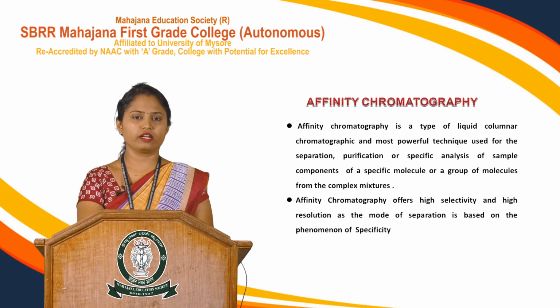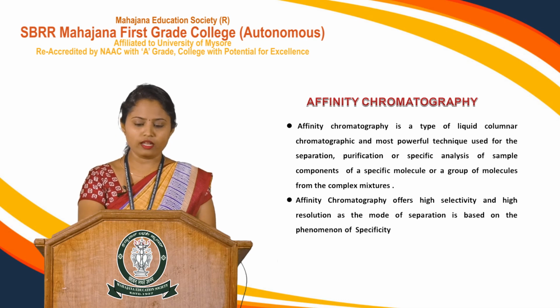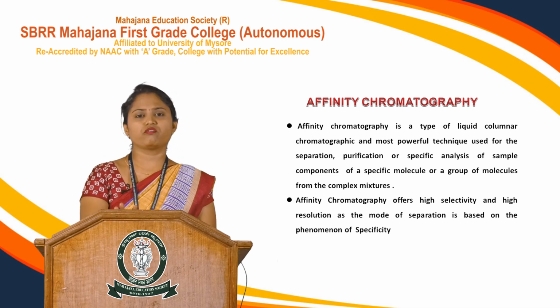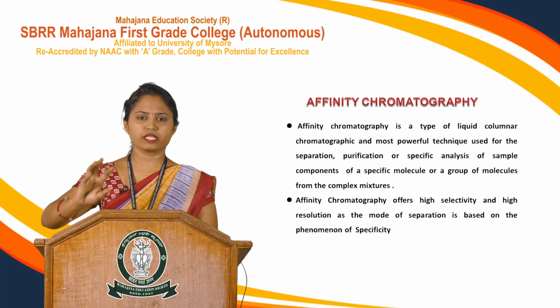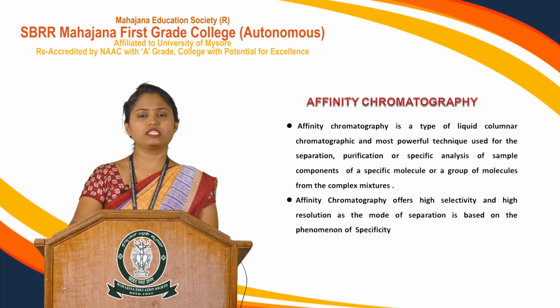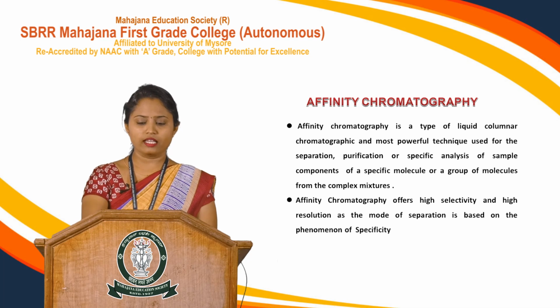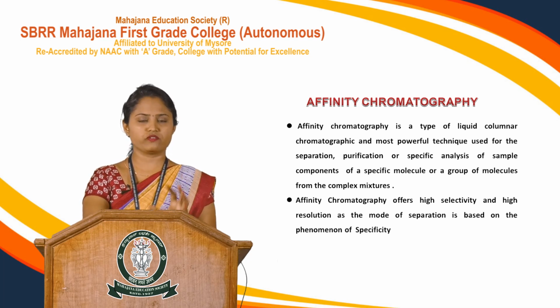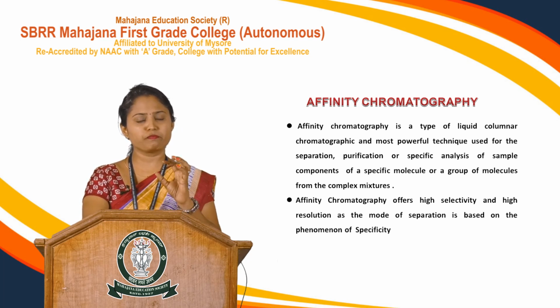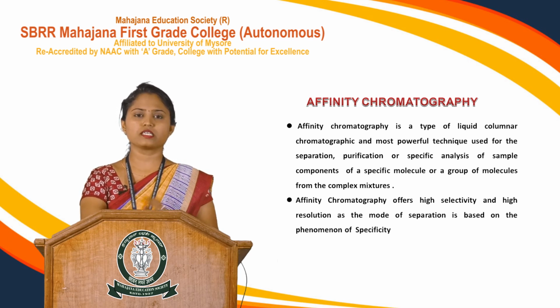So, you can also call it a solid-liquid type of chromatographic technique, where it is one of the most important powerful techniques for the isolation of very specific biomolecules, including carbohydrates, proteins, nucleic acids, even hormones, receptors, antigens and antibodies. You can isolate them, and this mode of separation is specifically for purifying specific analytes or specific molecules from a complex mixture.